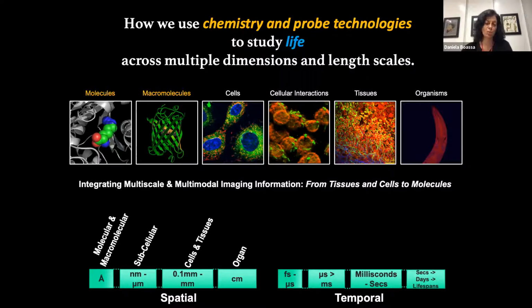of many cellular proteins. Our goal at the National Center for Microscopy and Imaging Research, led by Mark Ellisman, in collaboration with talented chemists, has been to develop and enhance molecular genetic probes and chemical labeling approaches to facilitate the application of correlated, multi-scale, multimodal imaging to biomedical research, where basically we integrate information across scales, both spatial and temporal, ranging from tissues to cells to specific organelles all the way down to molecular constituents.